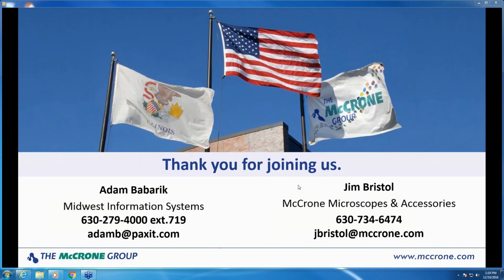Being modular, your lab has some options. Maybe you don't need full image analysis. Perhaps you just need a way to archive the images and simple annotations, like some of what we saw today. Whatever level you're at, we have a solution for you at competitive pricing.